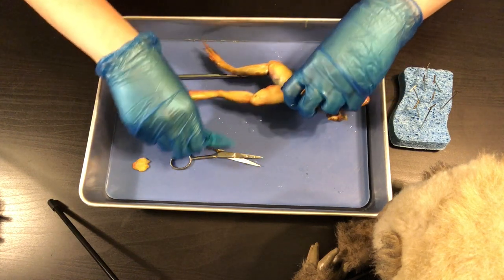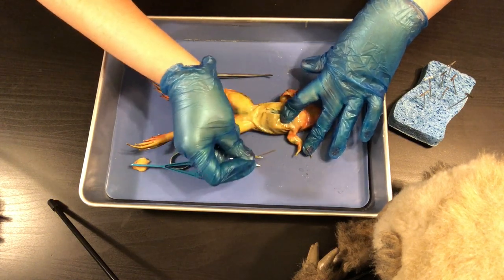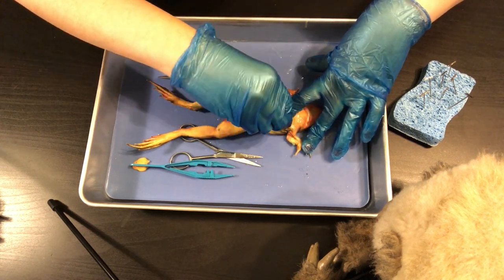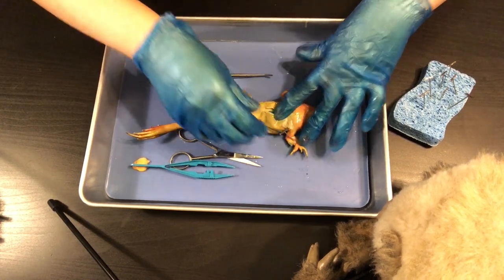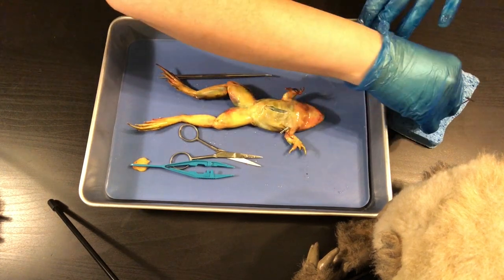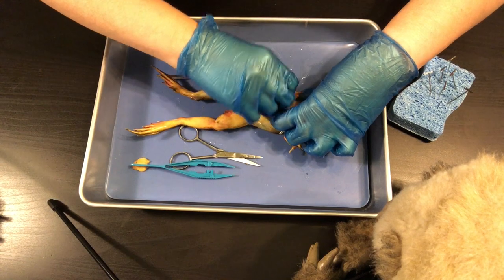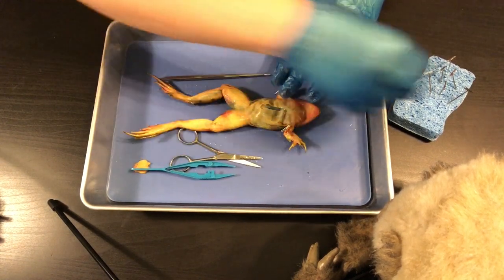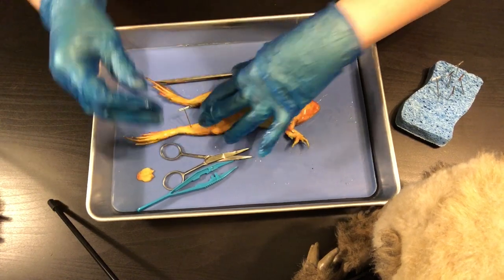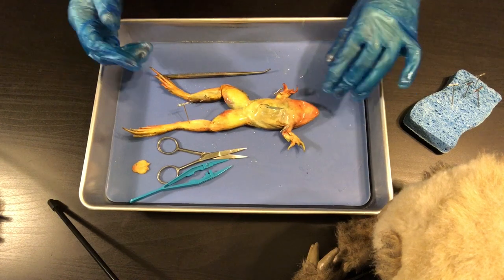When you're sticking your dissecting pins into your frog, it's best to go diagonal instead of straight up and down because it'll hold your frog a little bit better. Sometimes you have to be a little mean and break your little guy's arms so that it lays a bit easier — I just did that to help it lay flat. Then I'm going to do the same thing with the legs, going through some muscle to get them held down.